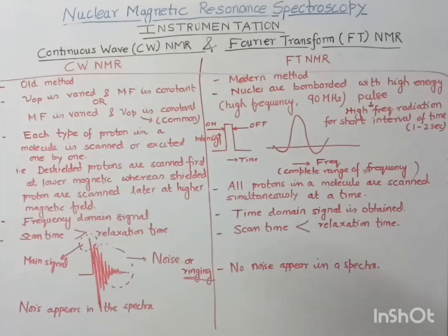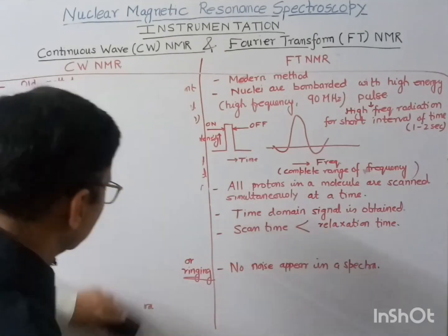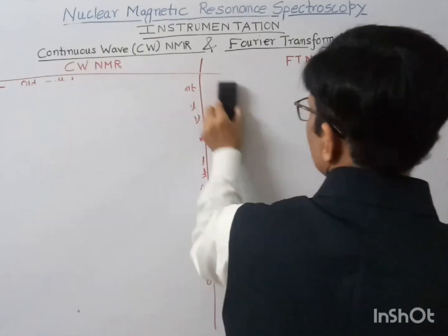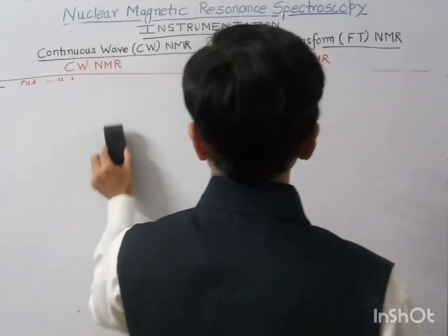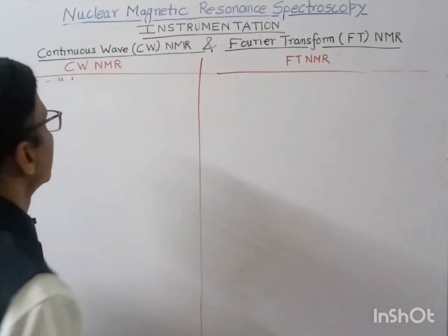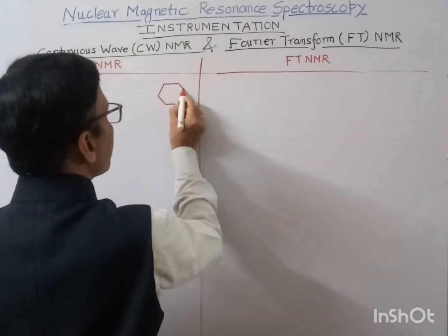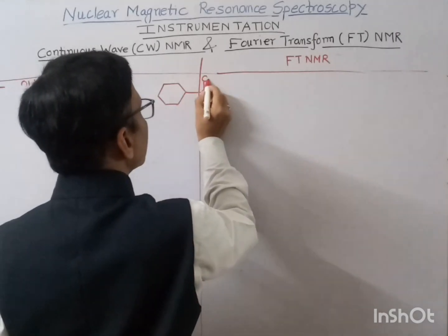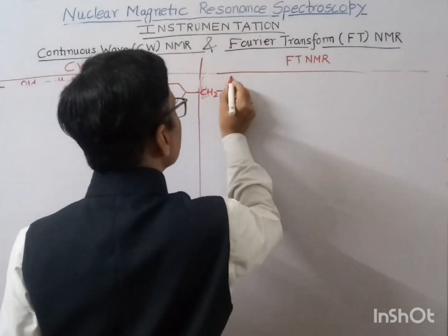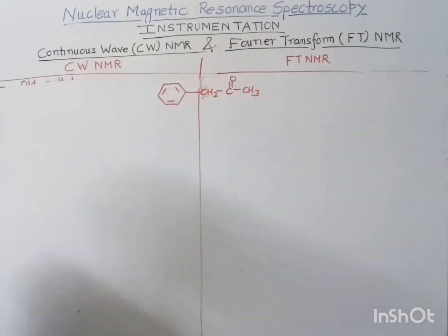Now let us see some more important differences. Suppose we have a molecule, phenylpropanone.